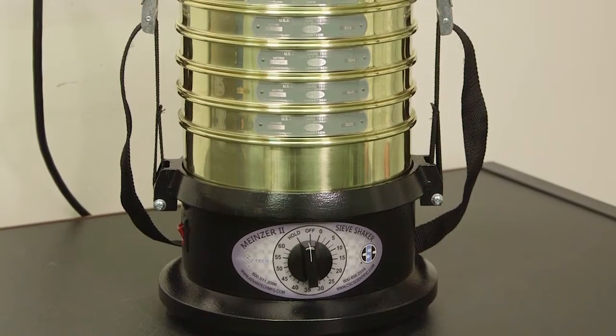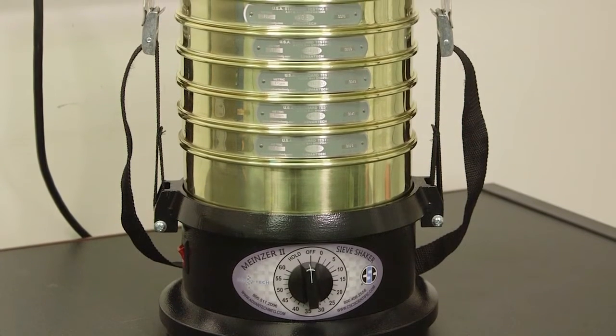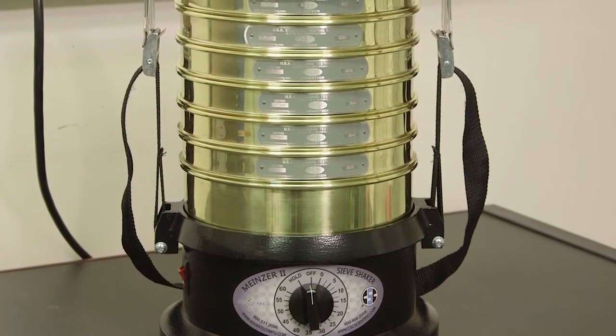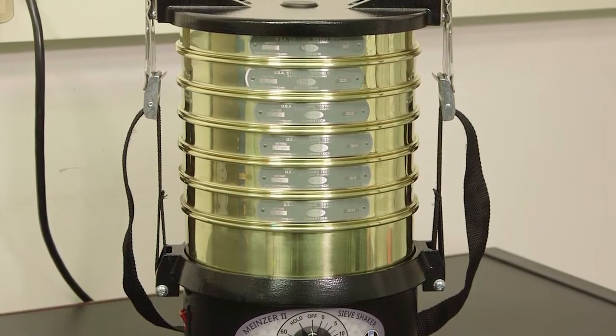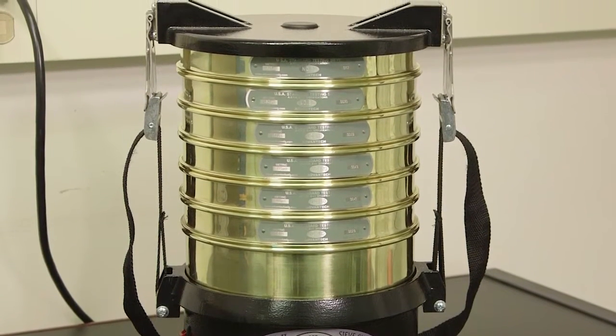By utilizing an electromagnetic drive, fixed amplitude, and rubber spring mounts, this unit produces the simultaneous vertical and horizontal movement needed for basic dry particle sizing analysis.